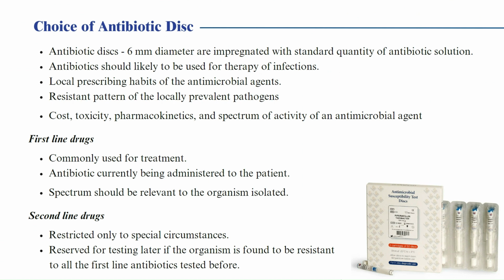Choice of antibiotic discs are done by the following criteria. Antibiotics should likely be used for therapy of infections. Local prescribing habits of the antimicrobial agents. Resistant pattern of the locally prevalent pathogens. Cost, toxicity, pharmacokinetics, and spectrum of activity of an antimicrobial agent.